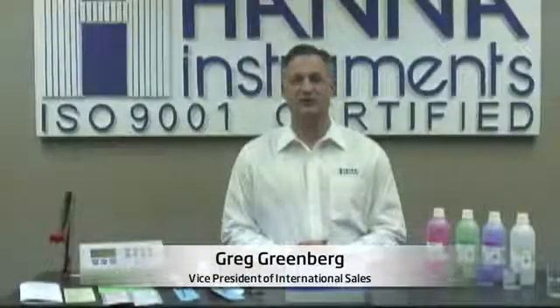Hi, my name is Greg Greenberg with Hanna Instruments, and today I'm going to introduce the HI-3000 Series Professional Benchtop Meters. In this series, we offer the HI-3220, which is our pH millivolt meter, the HI-3221, which is our pH millivolt ISE meter, and then finally the HI-3222, which is a two-channel pH millivolt ISE meter.